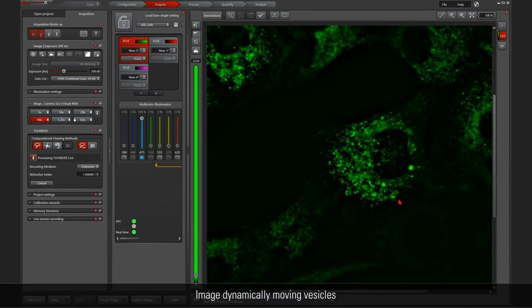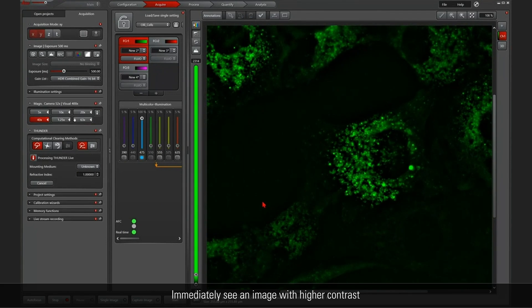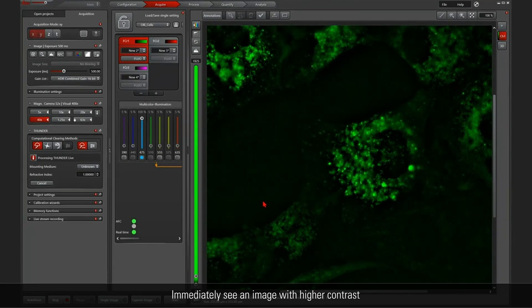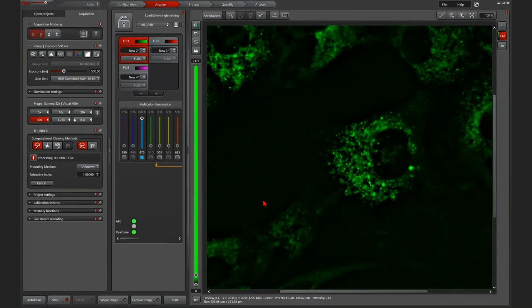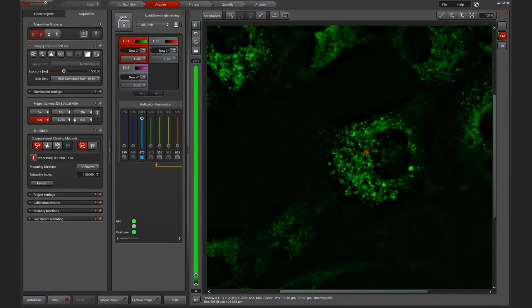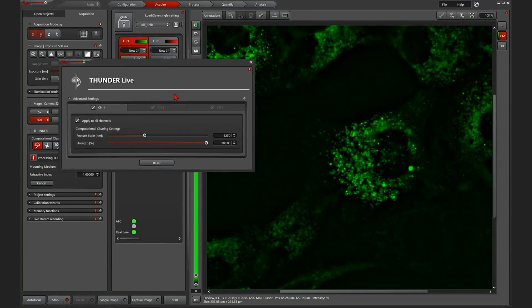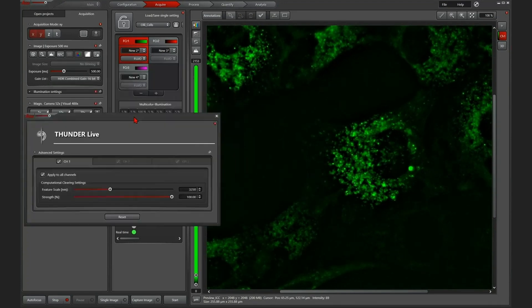So if I turn it on, you immediately see a better image, much higher contrast in the image, but you also can see that maybe there's room for improvement.